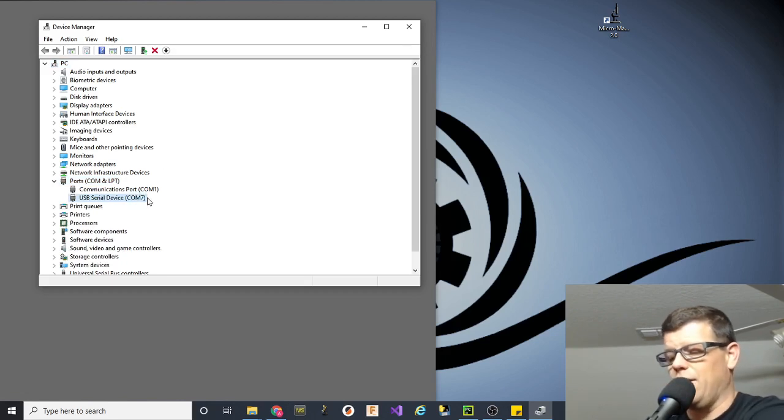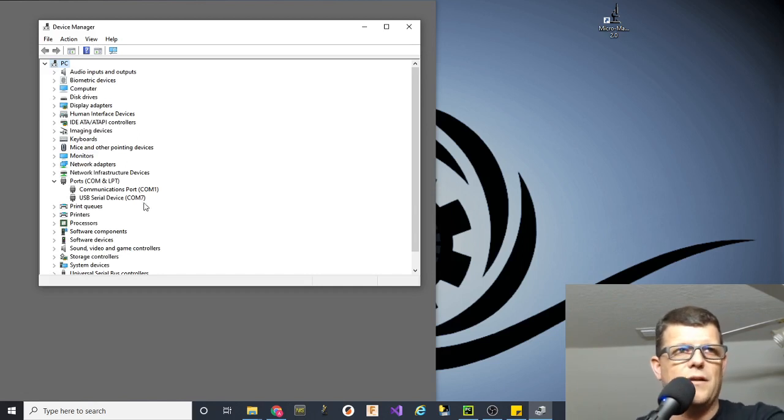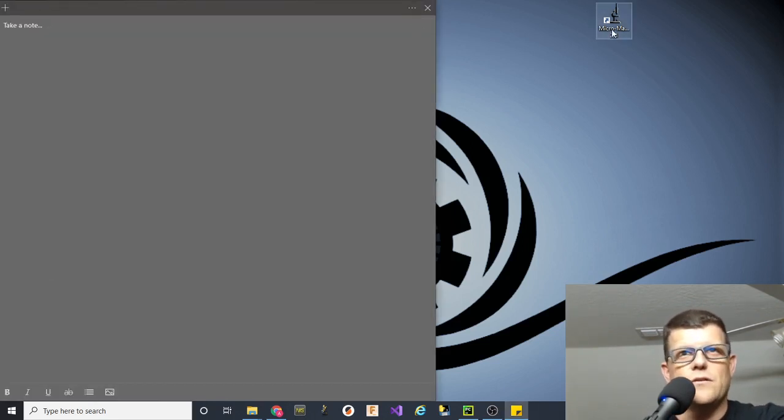I'll go ahead and do that right now, and you can see that the COM port disappears, and then I'll plug it back in. I'm just unplugging and plugging in the USB cable. So now I'm convinced this is on COM7. All right. Next thing I'll do is load up MicroManager.